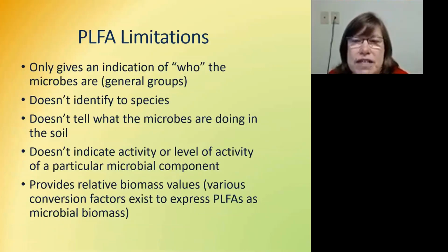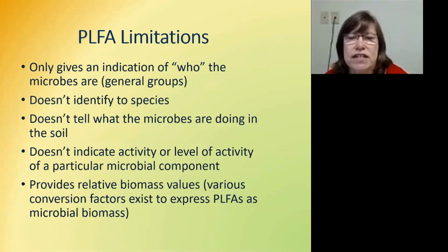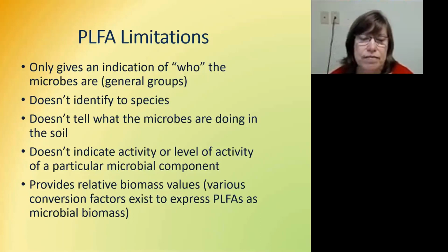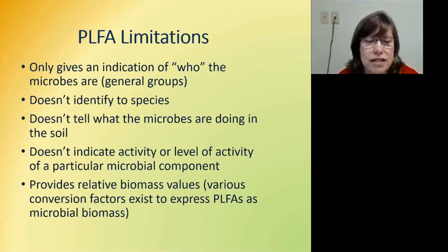There are some limitations to PLFA. It only gives an indication of who the microbes are, the general groups that you've seen. We don't identify the species. We don't really know what the microbes are doing in the soil, and since we don't know the activity, we don't know what level or how active they're being. We just know that they are there. So you may want to look at some other measurements of activity in addition to this analysis.